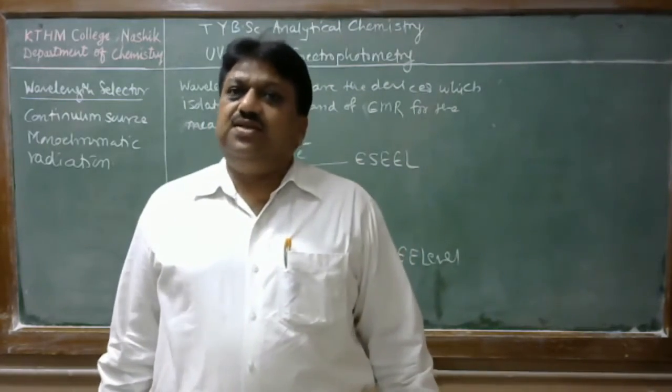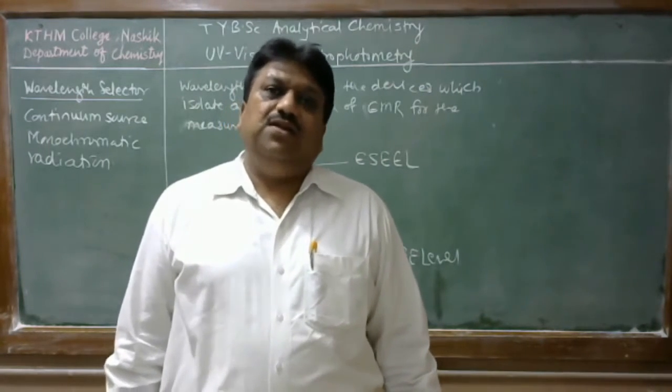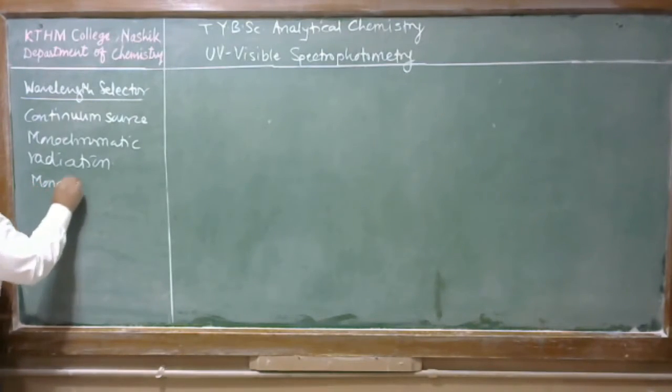Student, now we discuss what are different monochromators or wavelength selectors utilized in molecular absorption spectroscopy. That is, monochromators.